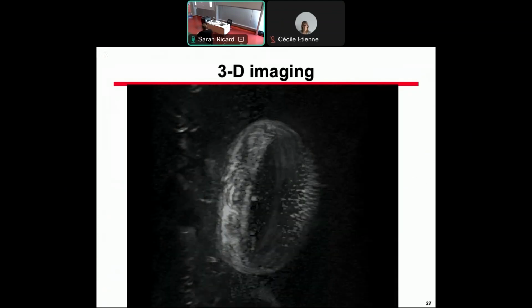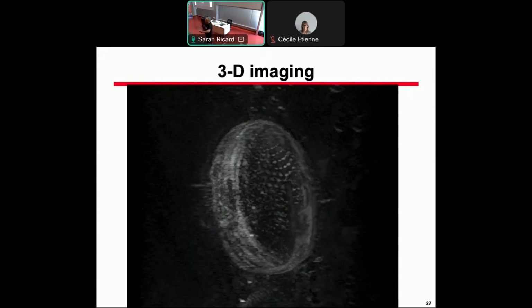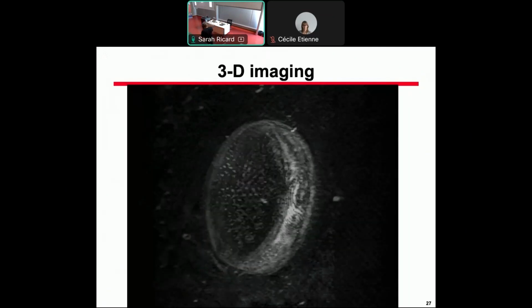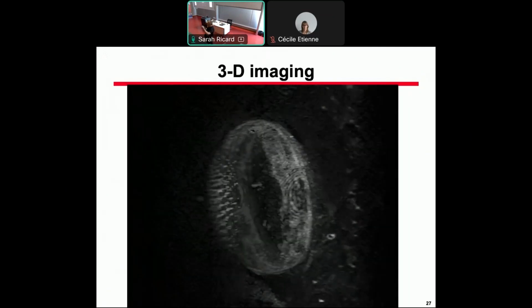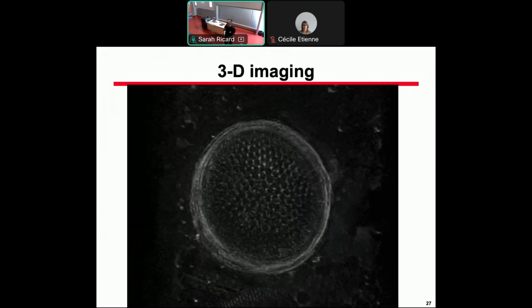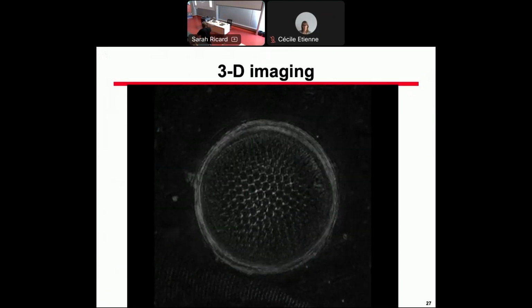To give you an idea of the difficulty, this is glass, fully transparent, in water, fully transparent, observed through glass slides, which are fully transparent. You take an aquarium, a very clean one, drop a glass ball and try to find the glass ball.